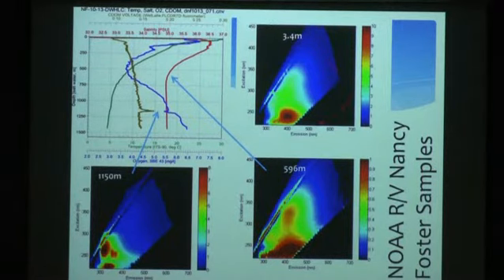Now these are EEMs that we took. This is 3.4 meters, so this is surface 1. This one is kind of in between. This looks like normal CDOM. This is the one that came from 1,150 meters. And again, you see this telltale characteristic, a really short emission maximum around 320 to 340, indicative of oil being in that spot. So this is something you can now do in profiling mode, potentially.